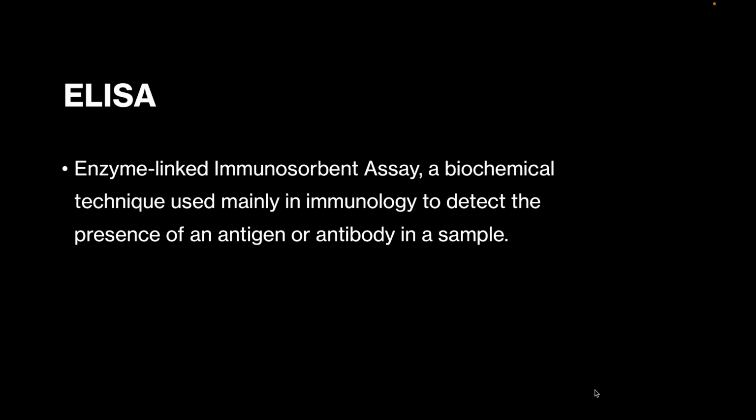So, what is an ELISA? As I have already said, it is a biochemical technique which is used in immunology to detect the presence of an antigen or antibody in a sample. So, what does that mean? I will go with the examples and then I will explain how it works.